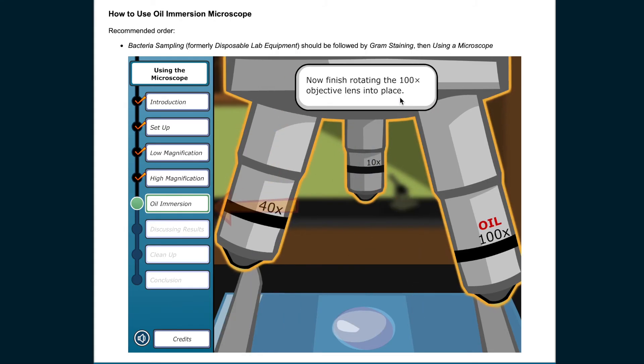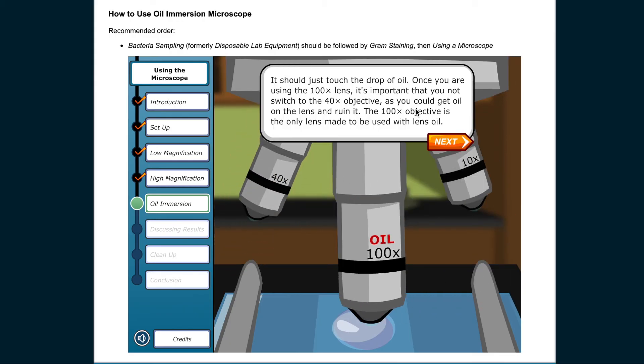Now, finish rotating the 100 times objective lens into place. It should just touch the drop of oil. Once you're using the 100 times lens, it's important that you not switch to the 40 times objective, as you could get oil on the lens and ruin it. The 100 times objective is the only lens made to be used with lens oil.